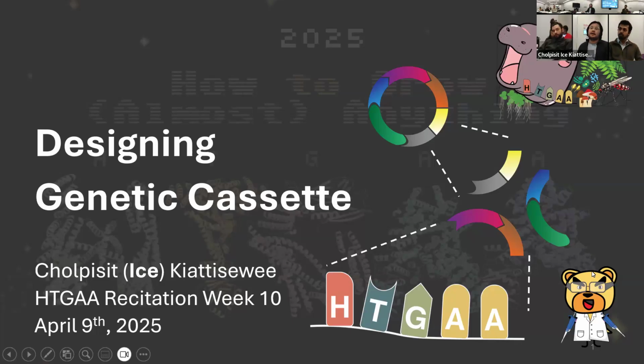Yes. The number of fragments or the number of pieces doesn't tell you how much it's going to cost. It's the length of the bases. So if you're trying to order a big DNA, it could cost more than just one simple DNA. So let's move forward with this, and we're going to figure it out at the end. All right, now let's get started.